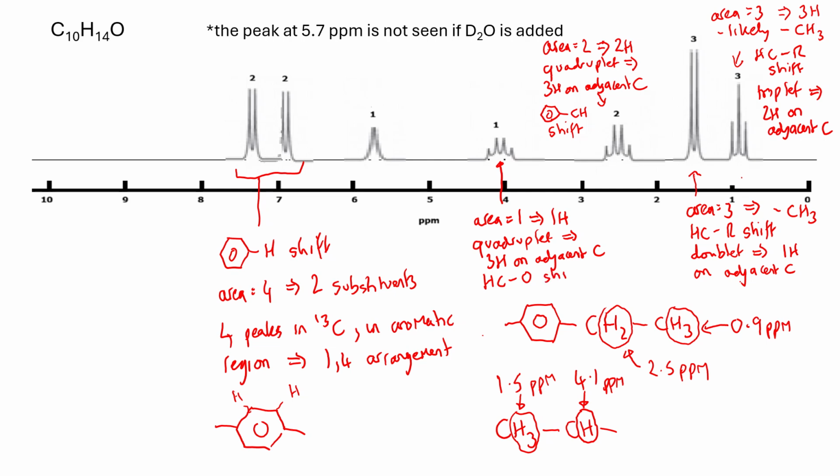And based on that, we can now add on to our structure that there must be an oxygen attached there. And of course, because oxygen forms 2 bonds, there must be another bond there on the other side of it. So we can deduce that bit of structure.